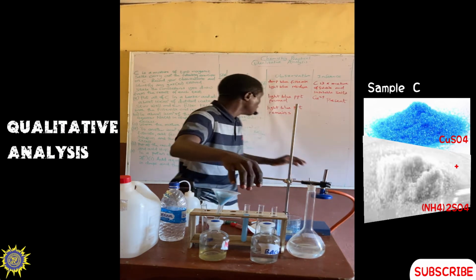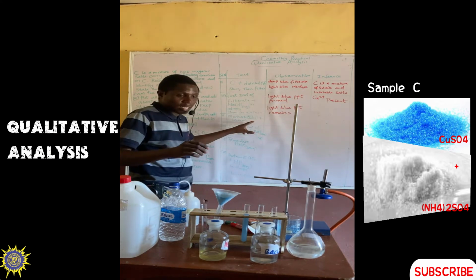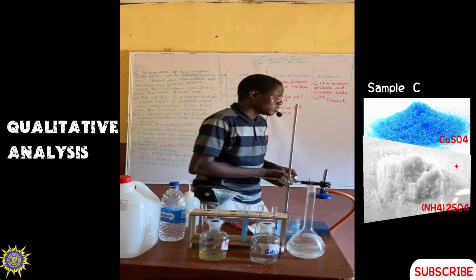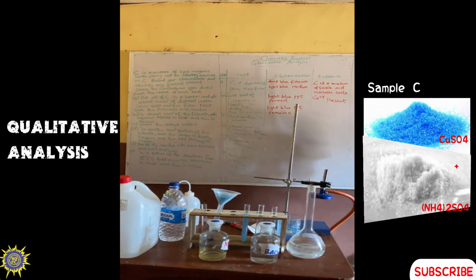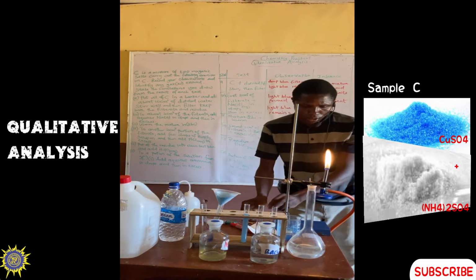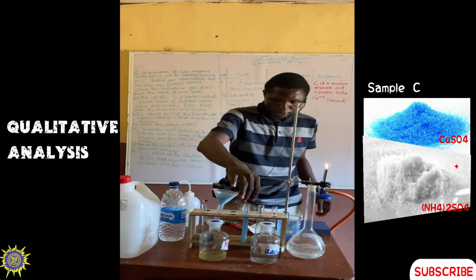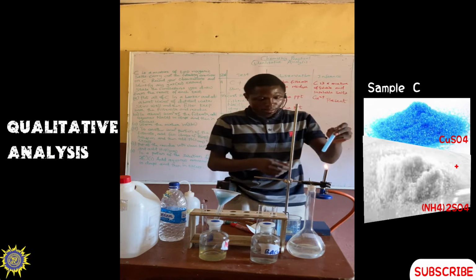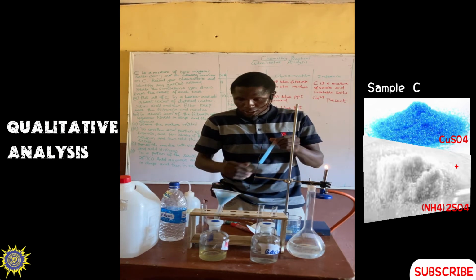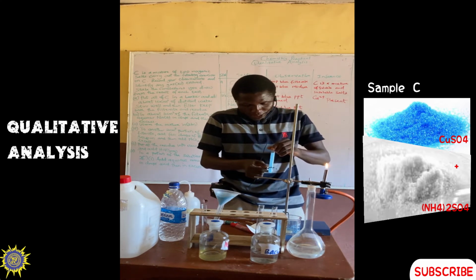We are now asked to warm the mixture. That is, we have to apply heat to it. So now, let me turn on the gas cylinder. So we have the flame now. Let's pick up the test tube holder to hold the test tube for heating.